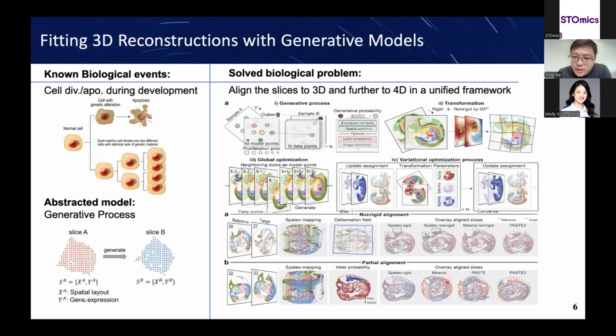In many public algorithms, because they need to achieve global alignment, the alignment seems to be rotated to have a minimal loss for that global alignment.